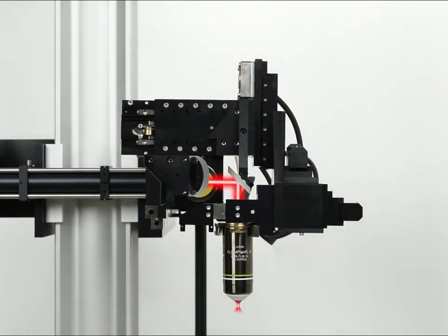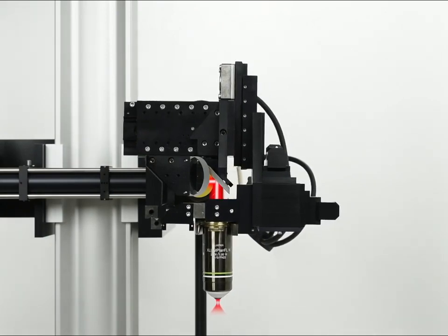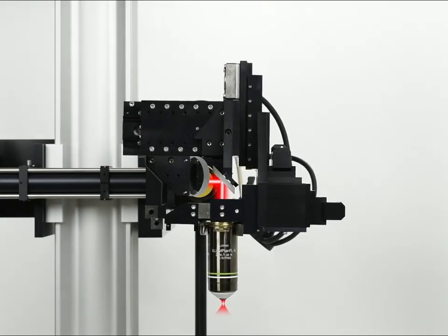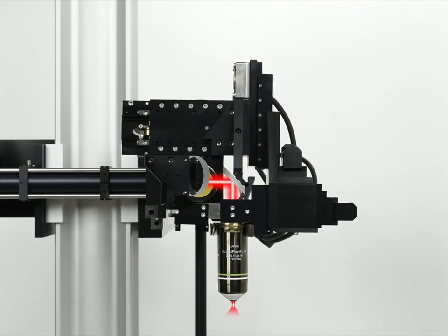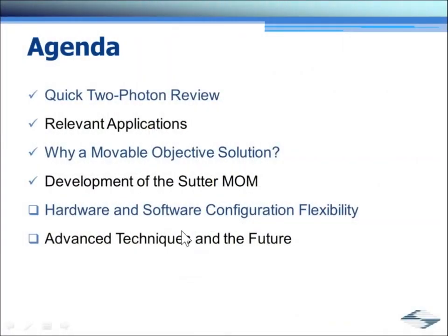So the flexibility of this microscope head is quite a convenience for a number of samples, as you can imagine. Okay, so next let's talk a little bit about the hardware and the software options for this microscope.